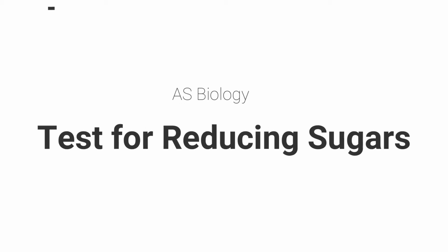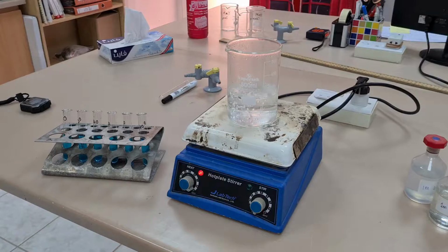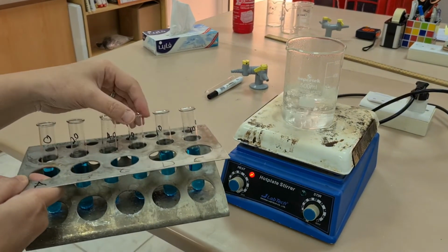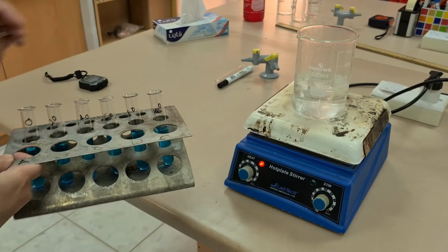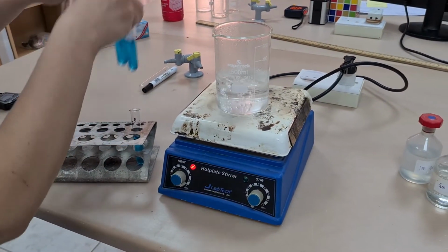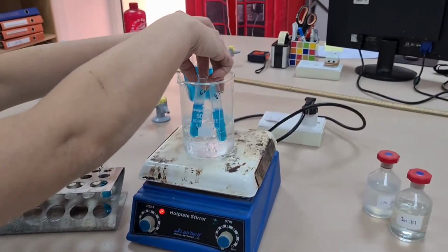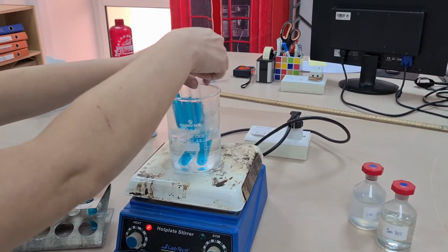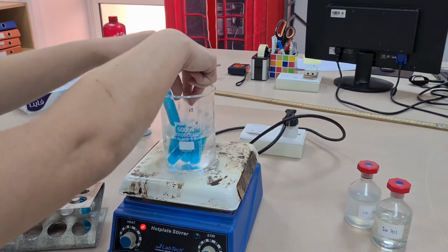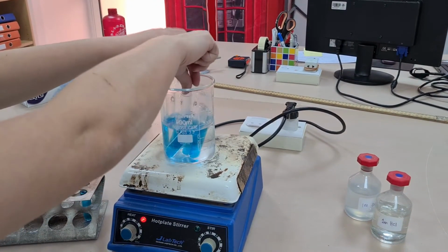This is the test for reducing sugars using Benedict's reagent. There are two types of Benedict's reagent. One is quantitative, which gives you an idea of exactly how much reducing sugar is in there, and another one which is qualitative, which is the one we're using today. It basically tells you, is the reducing sugar there or not?